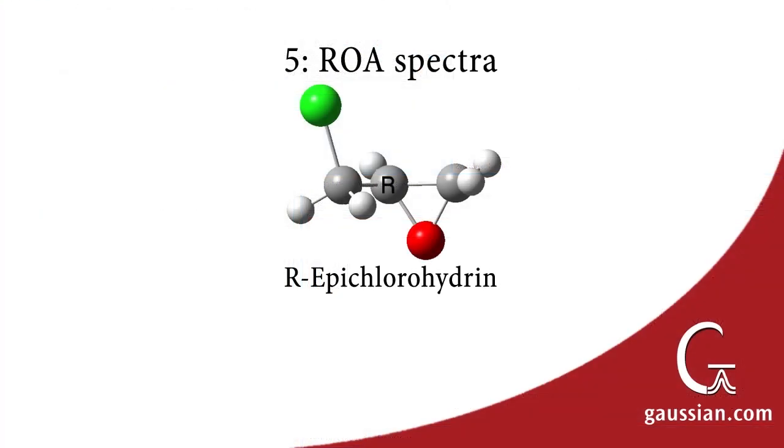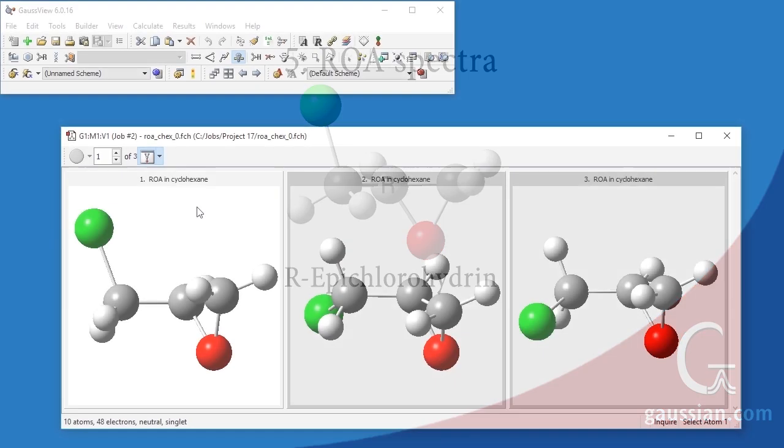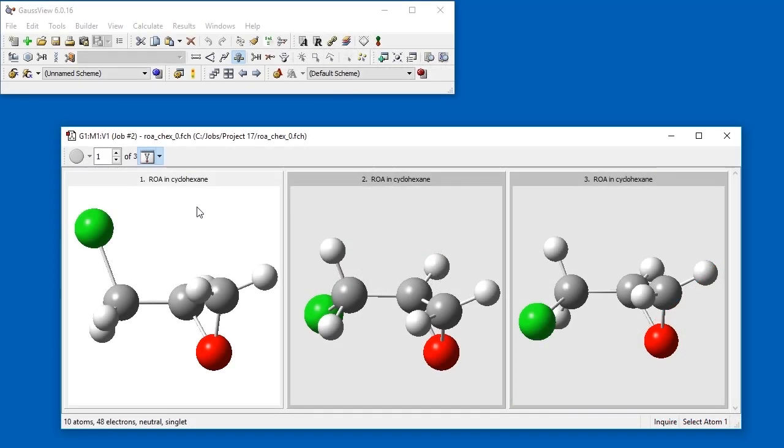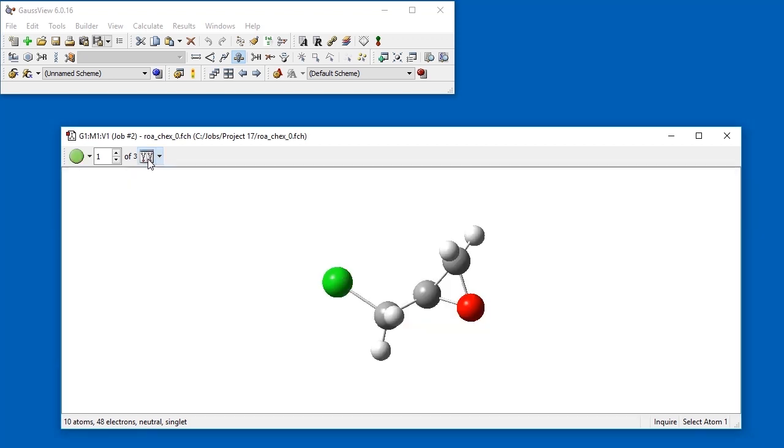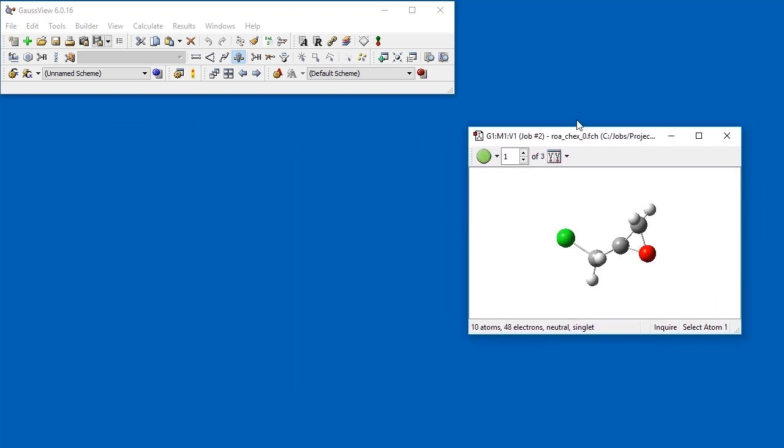Our next example examines the Raman optical activity spectrum of the small chiral molecule R-epichlorohydrin. The ROA calculations were performed in cyclohexane solution. This molecule has three conformations, corresponding to different values of the chlorine-carbon-carbon-oxygen dihedral angle, an anti-form and two gauche forms. We open the three checkpoint files into a single molecule group. We change the view to a single molecule and open the vibrations dialog.